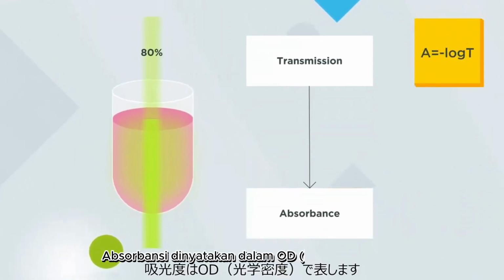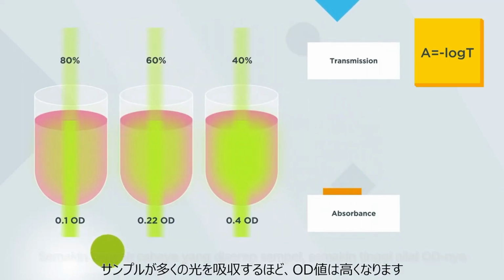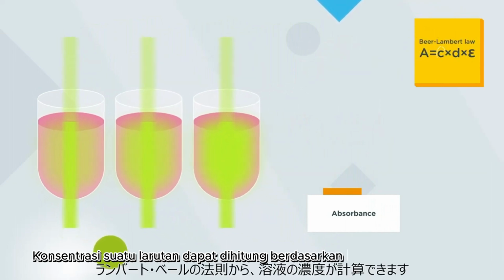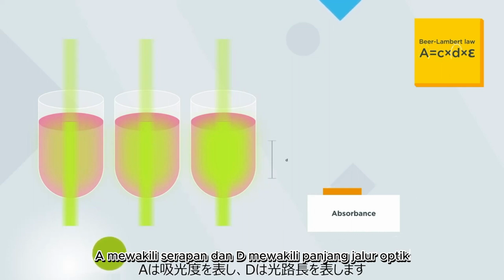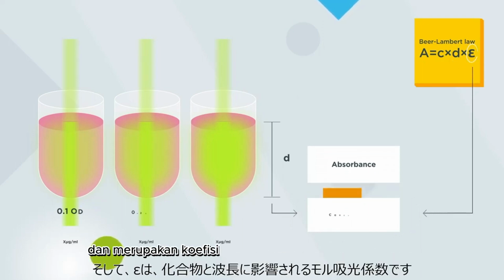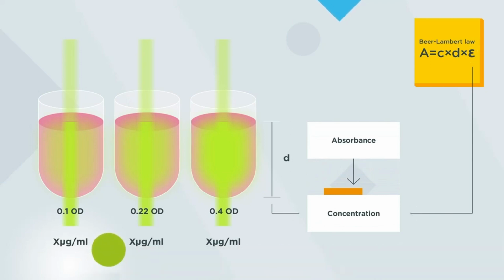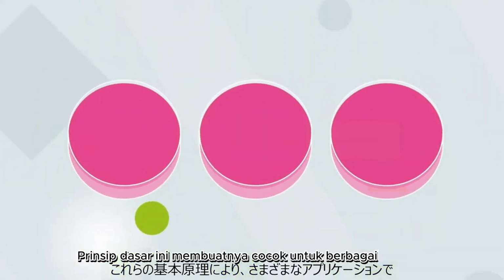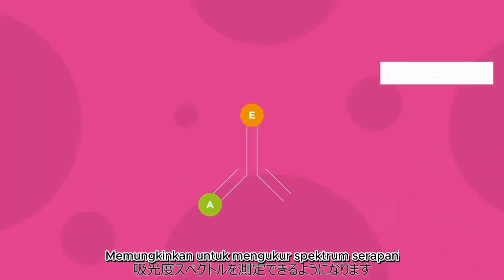Absorbance is a logarithmic function of the transmission, and it's given as an optical density, known as OD. The more light a sample absorbs, the higher its OD value. Using the Beer-Lambert law, the concentration of the solution is calculated, where A stands for absorbance, d for the light path length, which depends on the sample volume in the well, and epsilon is the extinction coefficient, which is compound and wavelength specific. These basic principles make it possible to use the absorbance spectrum for many different applications, which highlights its versatility in your lab.